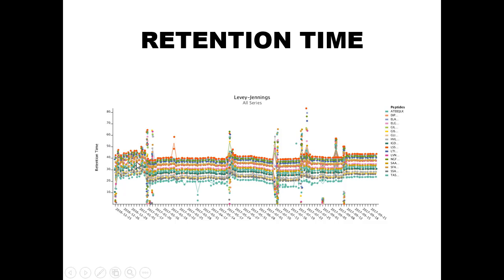My system suitability performance was very low in December because these points are scattered. They're not very parallel. There's not a clear trend. By the time January came around, I had stabilized the system suitability because these lines became a lot more parallel.